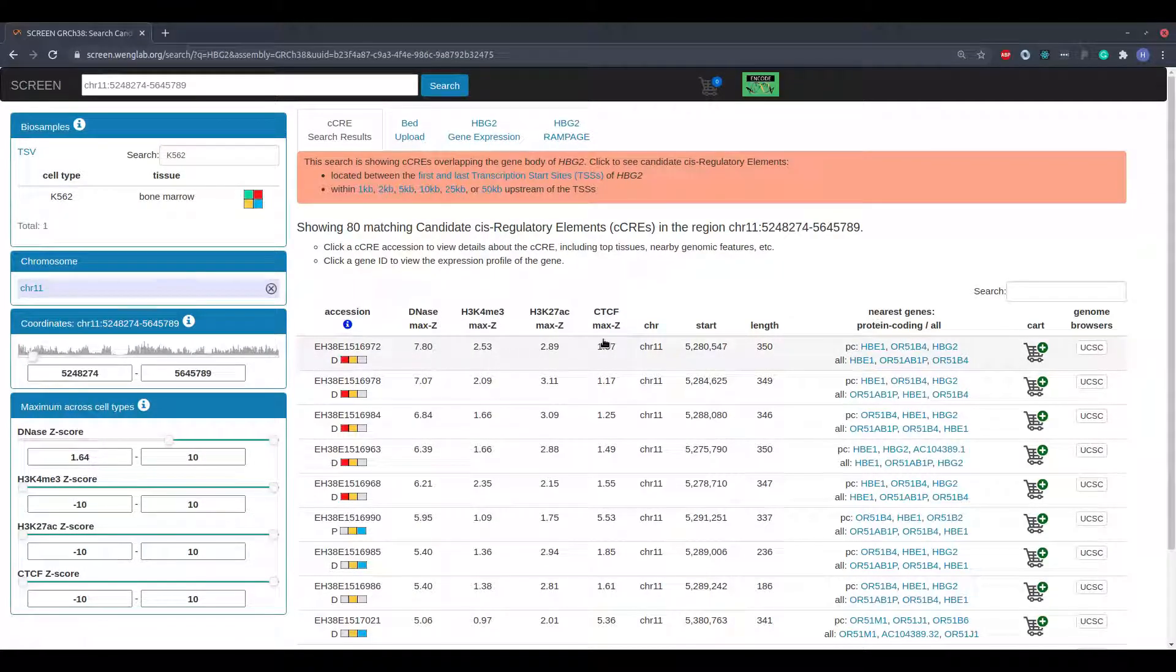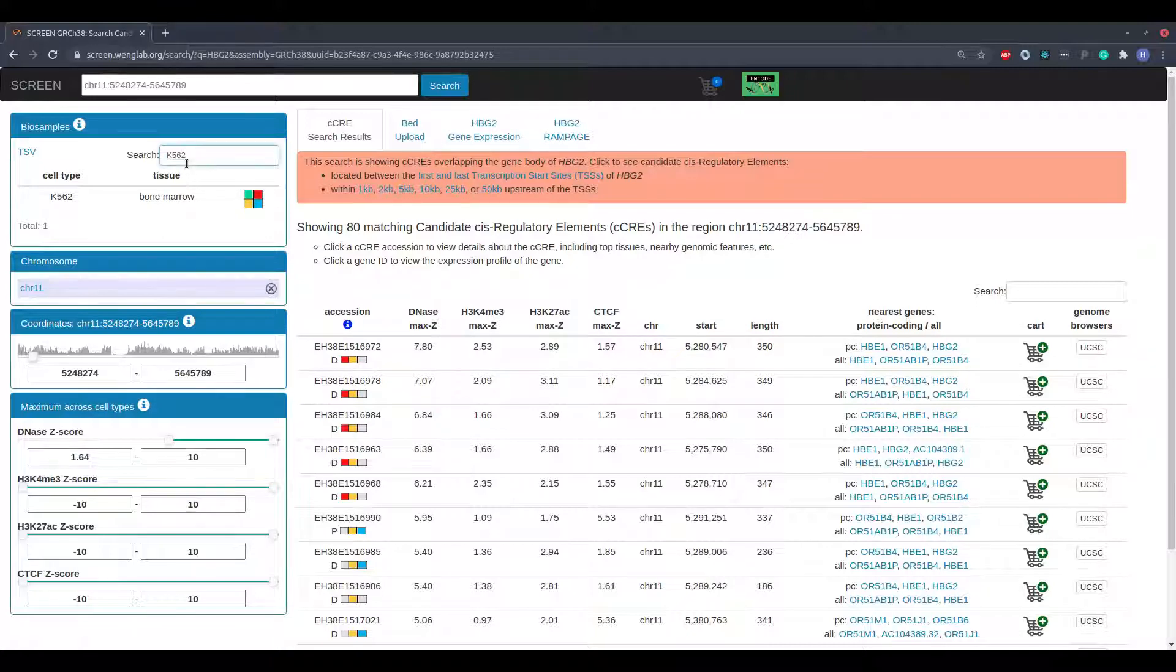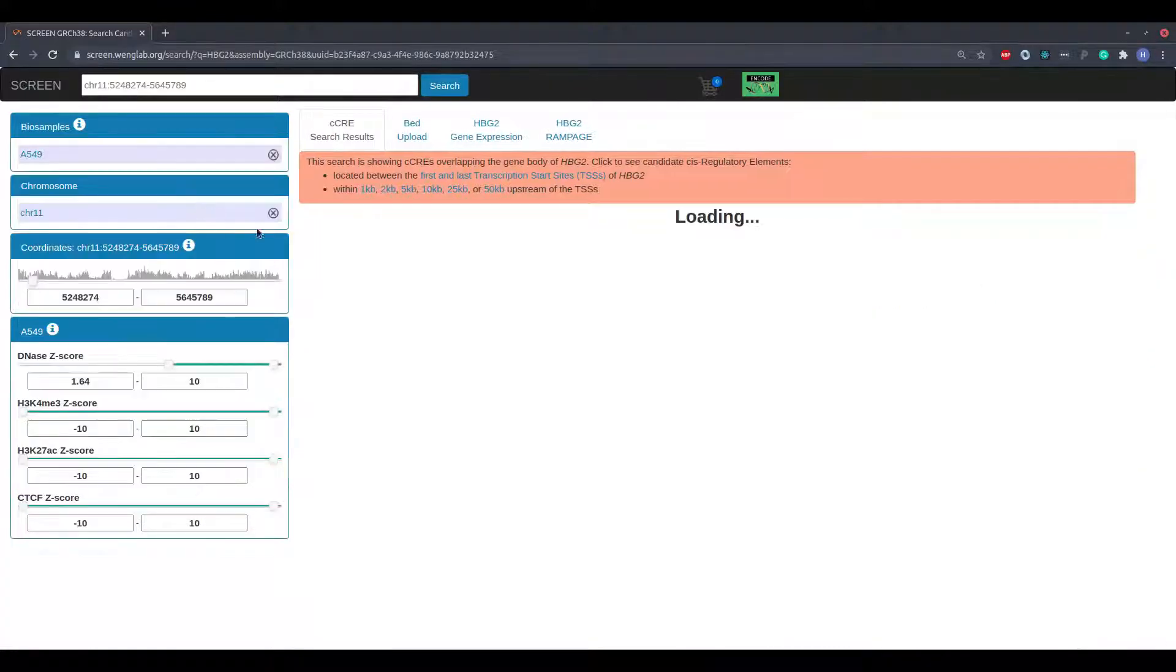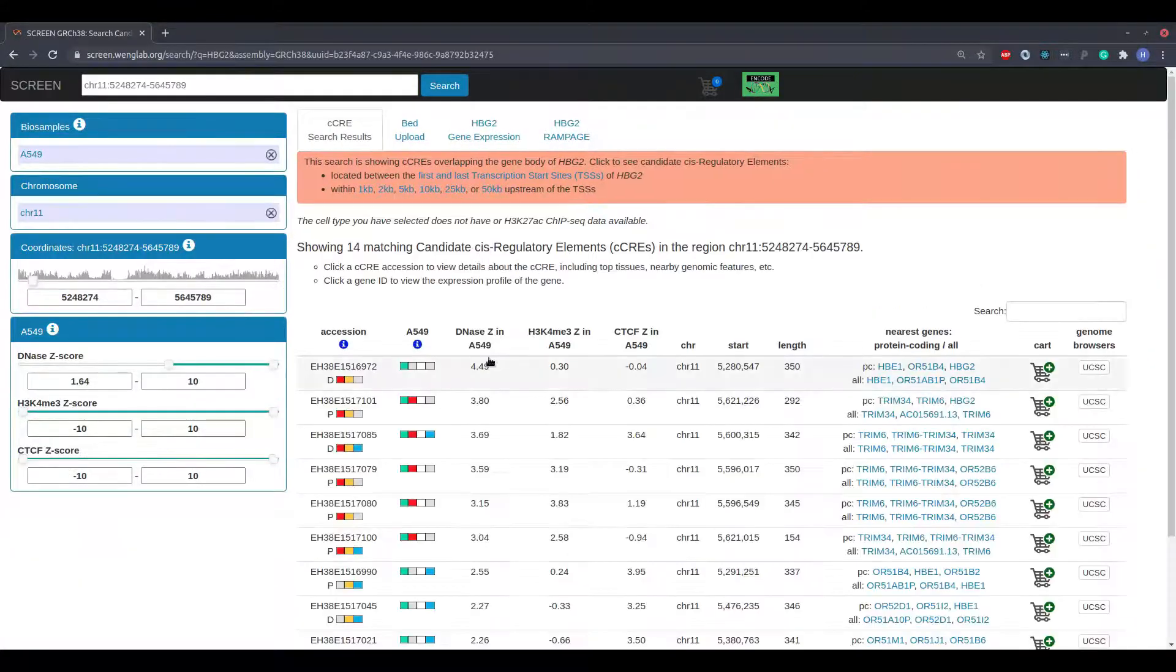When no experiments have been performed for a particular mark within the selected cell type, the corresponding column is hidden.